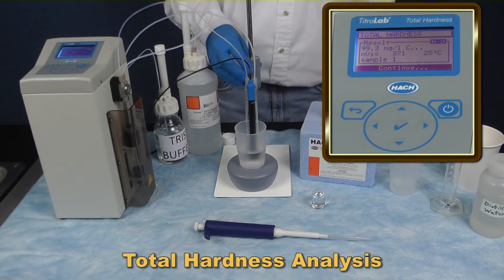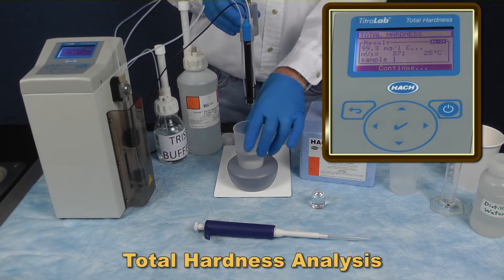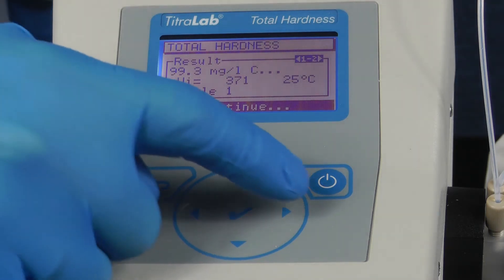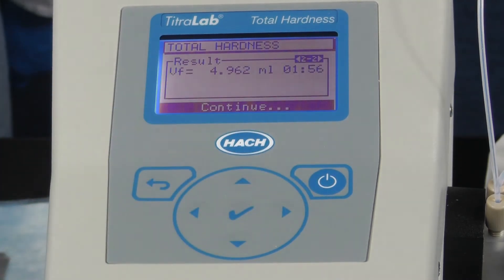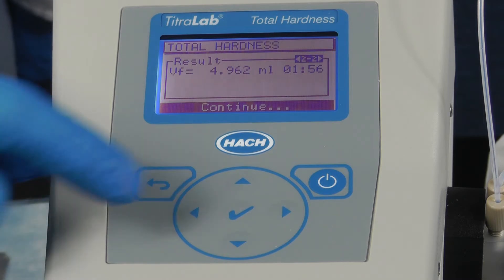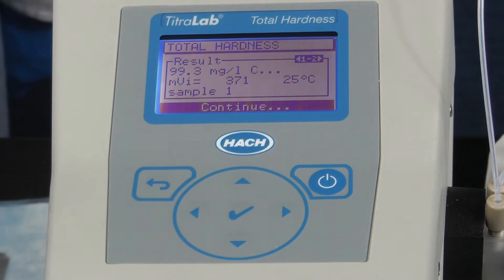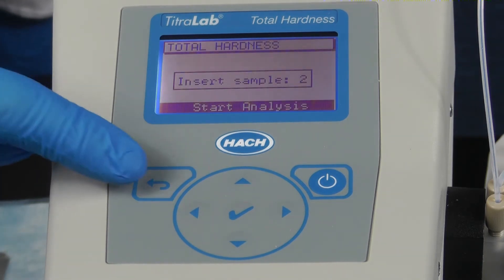Once the analysis is completed, your results are displayed on the screen. Here are the results for our analysis. If you press the right or left arrow keys, you can see the volume to reach the inflection point of the titration. Our result of 99.3 milligrams per liter CaCO3 is within the expected range of plus or minus 10% of 100 milligrams per liter CaCO3. Press the return key to return to the main menu.